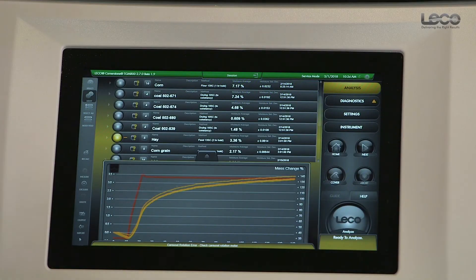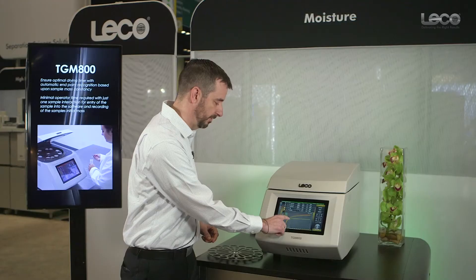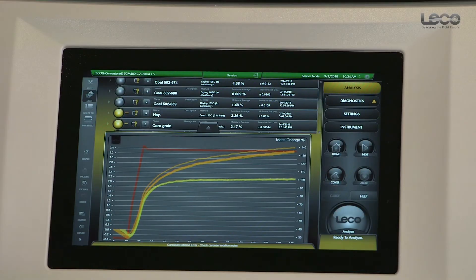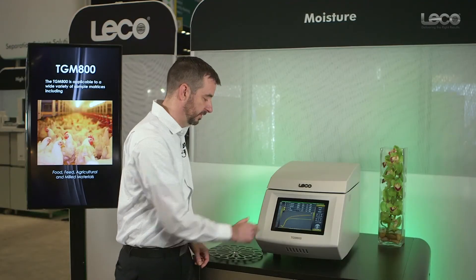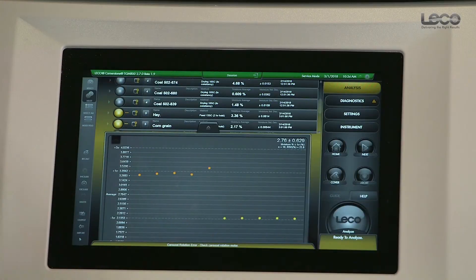All of the data is organized so we can automatically plot it, and we also overlay the temperature range for the oven. The operator can zoom in closer to areas of interest and then change to review the full analysis. We can also restore the plots and go into a scatter plot mode to review how replicates within a set performed in terms of precision, or plot the first and second signal values versus the results of those replicates.